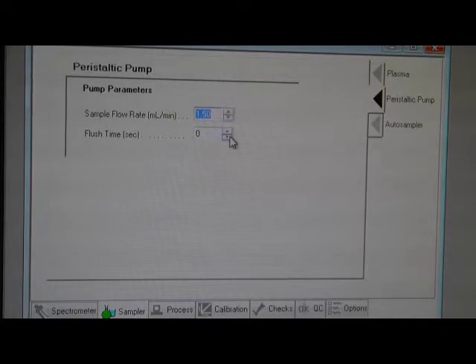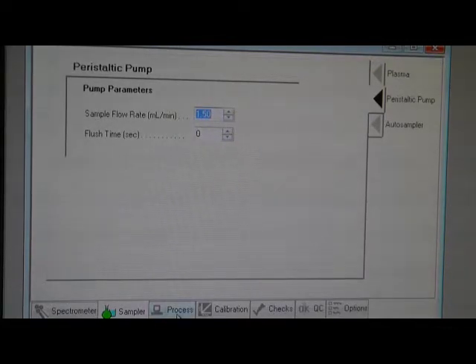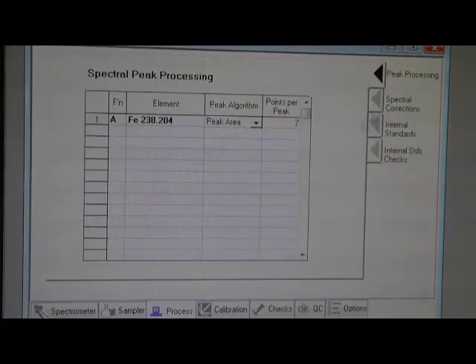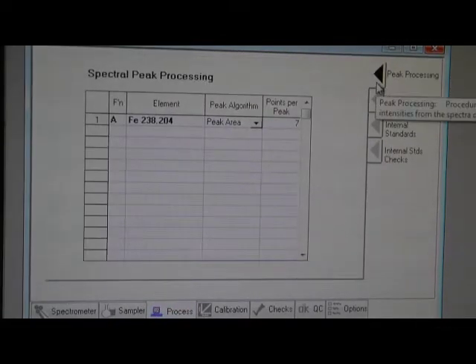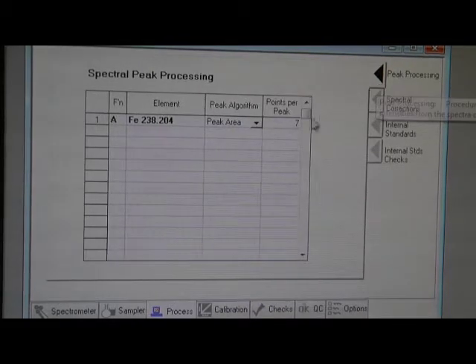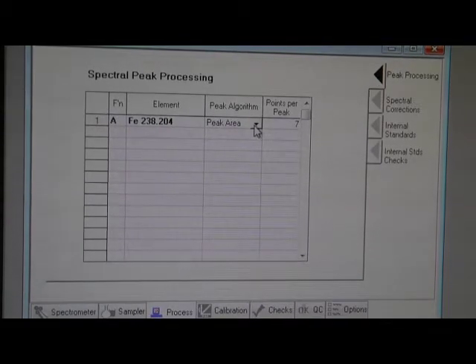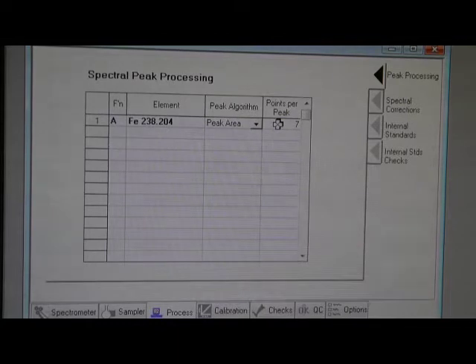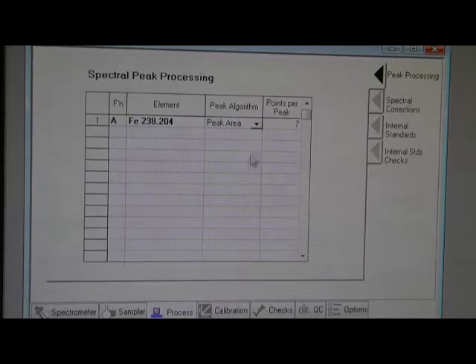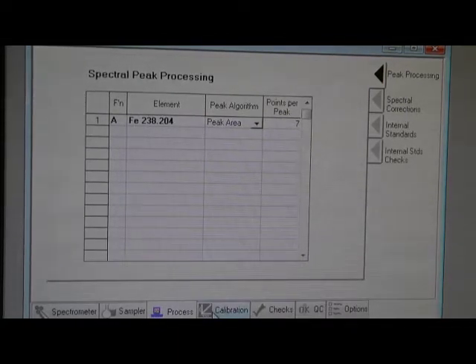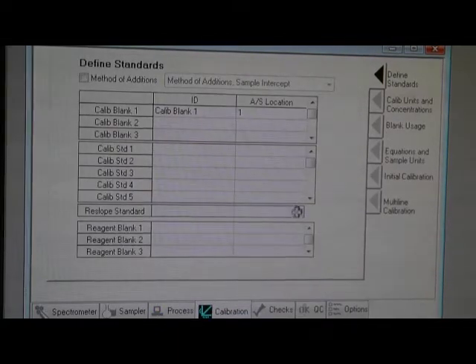Next one is the process. Peak process: peak area 7. And then go to next, is calibration.